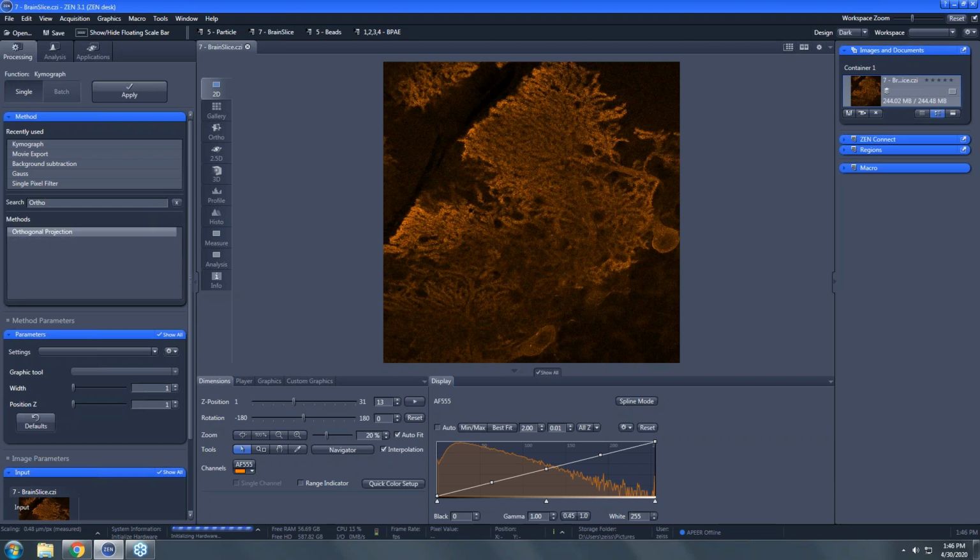If you're like me and you may not be certain of the spelling of orthogonal, I guess I would have gotten the first 5 letters no problem at all. So I might have just typed an I in ortho. That's all I typed in there. It's the only thing in this processing tab that should come up. It says orthogonal, yeah. Okay, so we've selected the orthogonal projection.